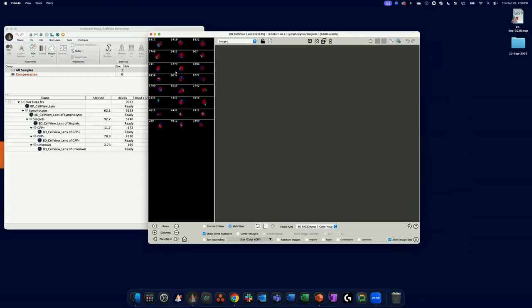And maybe I want to build a set of images that have really good central GFP expression. So I'll start just clicking images and kind of building my list here. Right? And you can see that I'm making a list of GFP images that I like that I'll want to revisit at some point. Okay? And when I'm satisfied with the list, I can lock it. And I can always come back to this set.